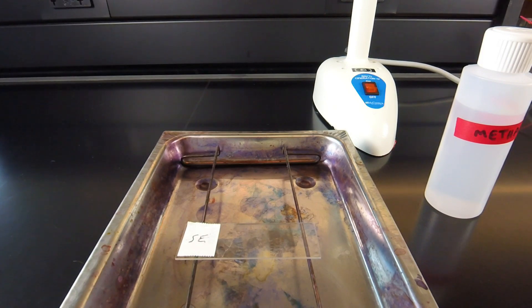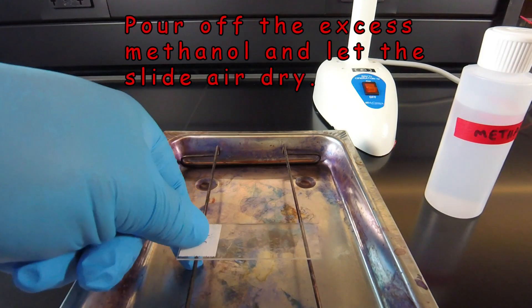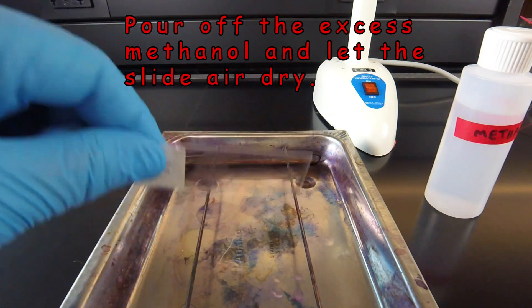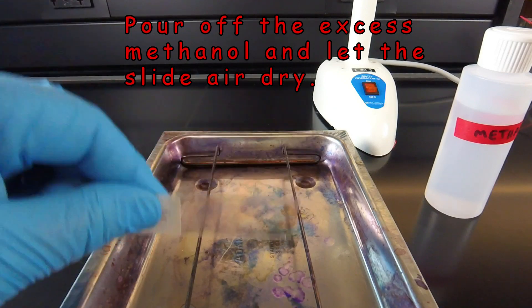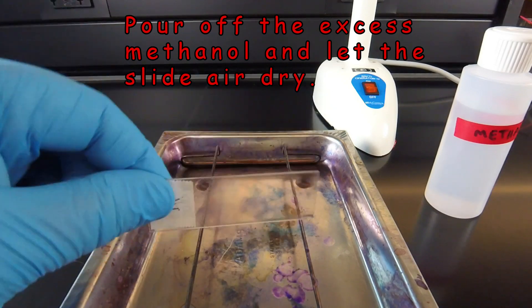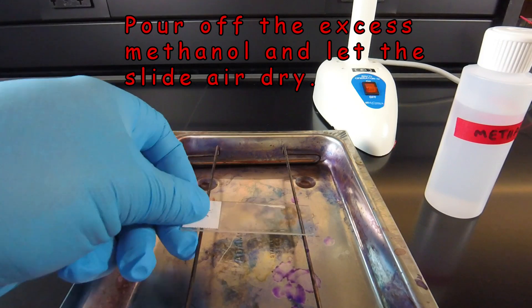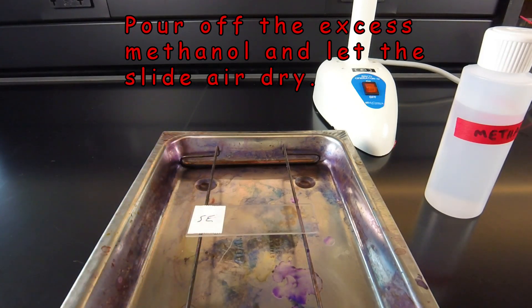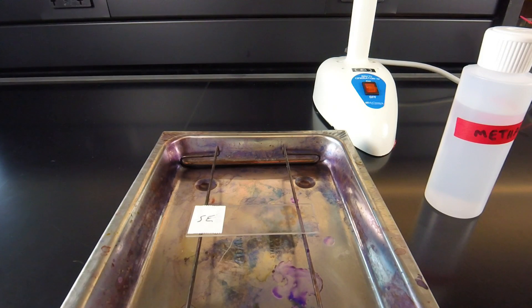Now that two minutes have gone by, all we do is pick up our slide. We're going to let the methanol drain off into the staining tray. And then we're going to put it back on the rack, and we have to let it completely air-dry. At that point, the slide will be ready for staining.